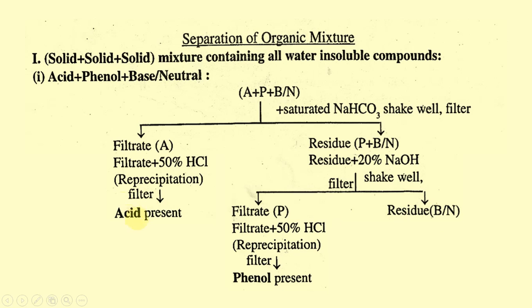So this is the first compound, this is the second compound and this is the third compound. So this chart follows the acid, phenol and then base or neutral nature.